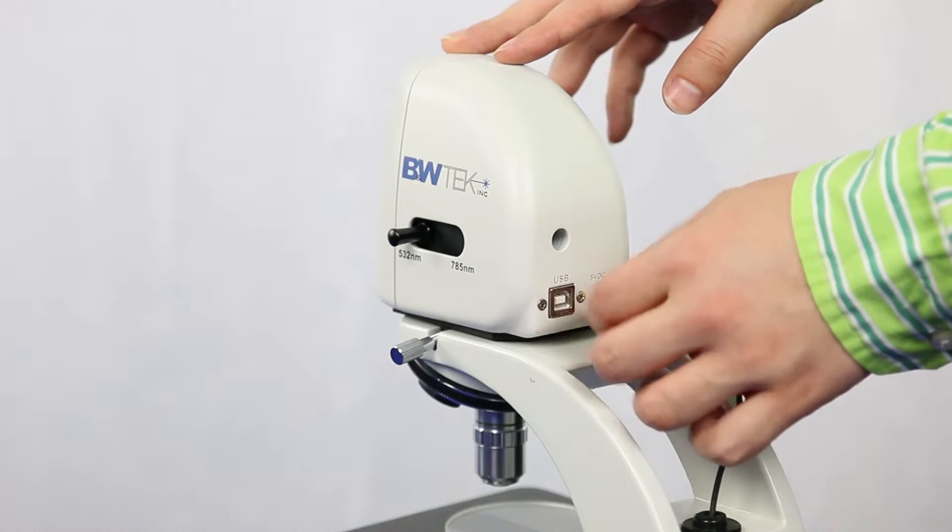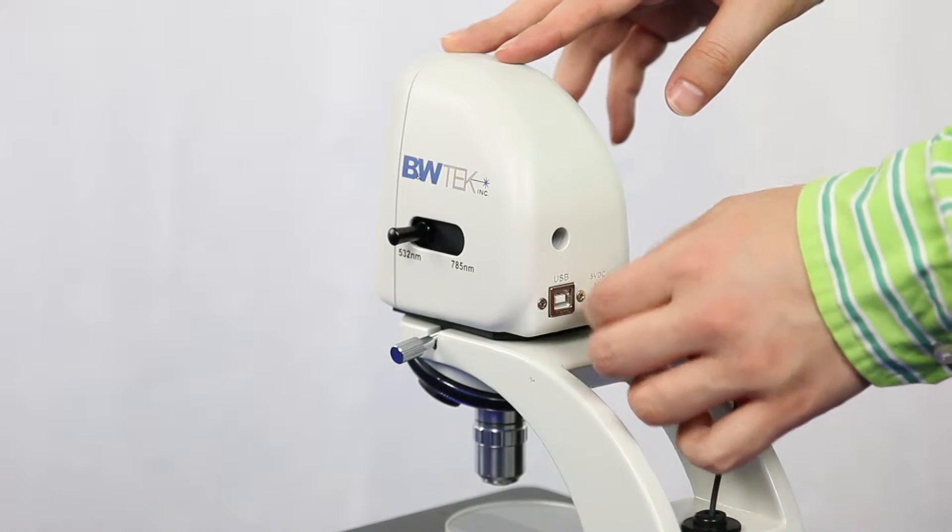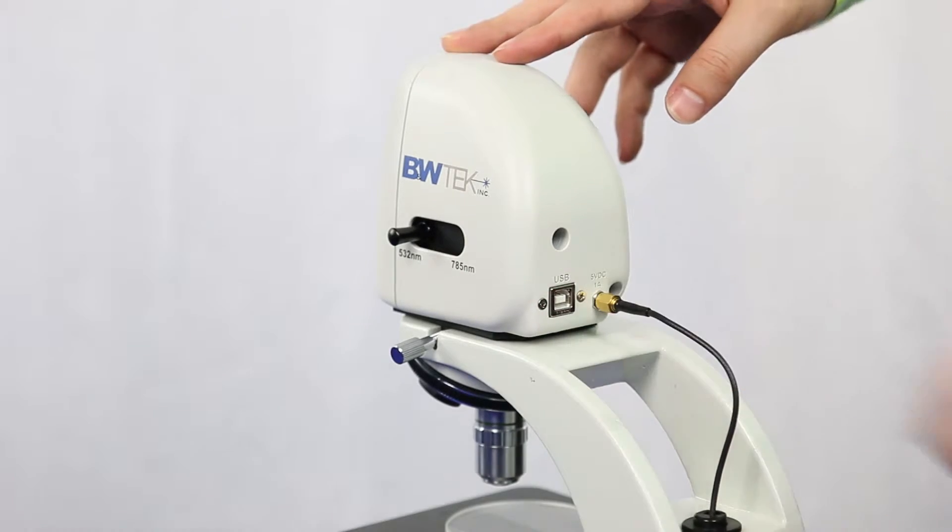You'll then want to take the 5 volt auxiliary cable for the microscope light and connect it to the back of the microscope head.